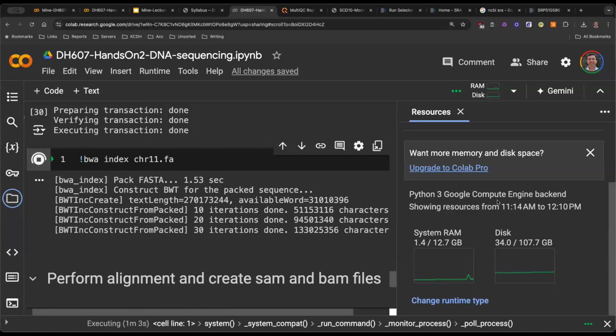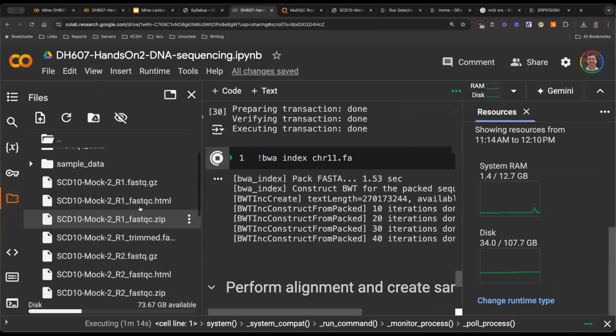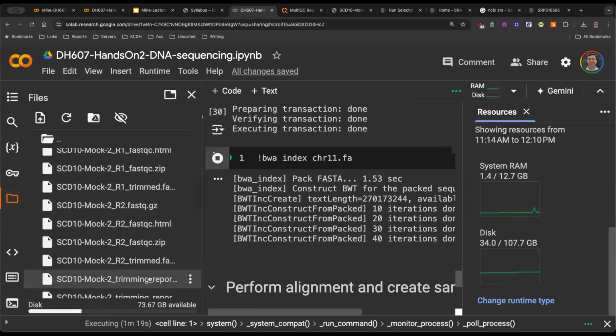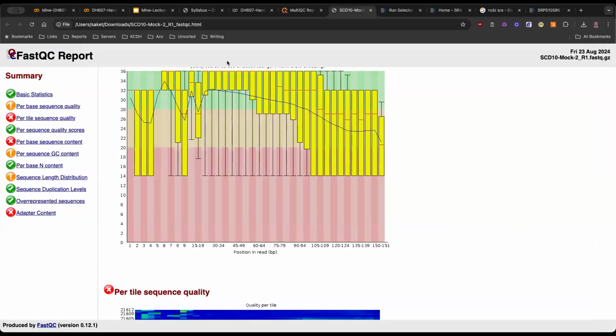Yeah, what was the MultiQC doing? With MultiQC, we created FastQC reports for individual samples. Now, if you want to really check the quality of each sample, you'll have to download this file, so this is R1, then download R2, and keep doing this. Imagine you had like 94 samples. This is 94 cross 2, which is 188 files. You'll have to manually see all of them one by one. What MultiQC is doing is putting them together.